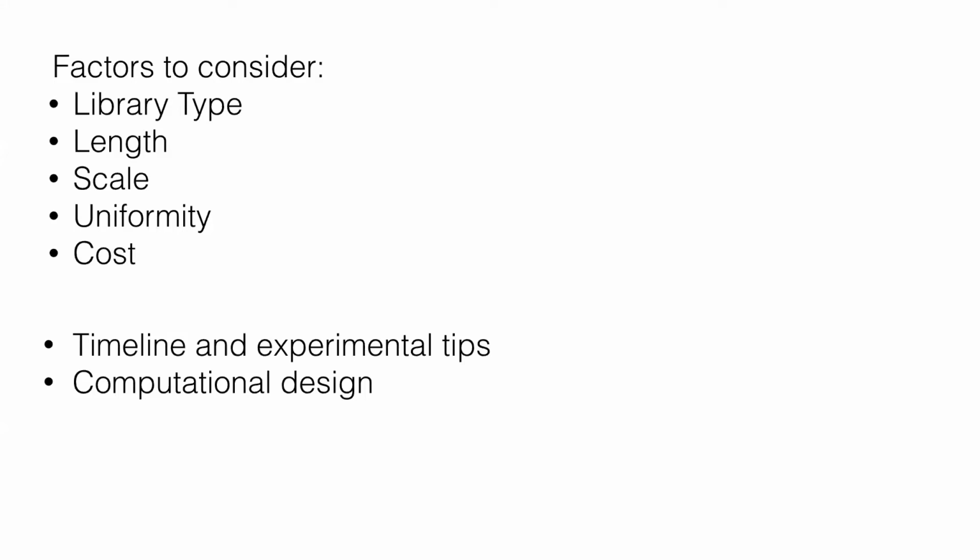In terms of uniformity, the arrays, if you believe the vendors, are pretty decent. DropSynth is pretty poor, as you will see. So that's something you have to live with. And in terms of the cost, individual oligos can range anywhere from several cents to several tens of cents each.